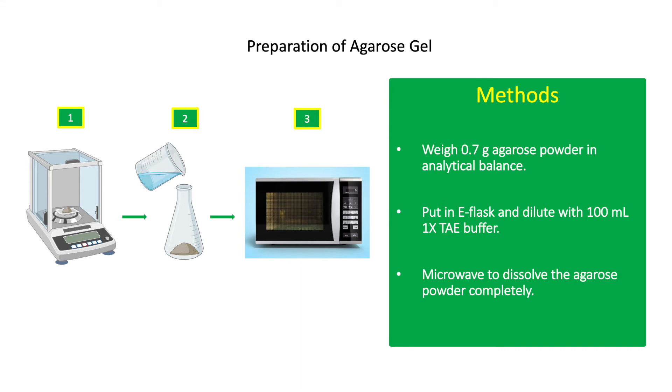The first step in gel electrophoresis is to make an agarose gel where samples are loaded for analysis. Agarose gel concentration may range from 0.5 to 2%. Smaller DNA fragments can be better resolved using gels with higher agarose concentration, whereas samples like genomic DNA with higher molecular weight can be better resolved using less agarose concentration. For 0.7% agarose gel, weigh 0.7 grams of agarose powder in an analytical balance, put it in an Erlenmeyer flask, and dilute with 100 ml of 1X TAE buffer. Microwave to dissolve the agarose powder completely.